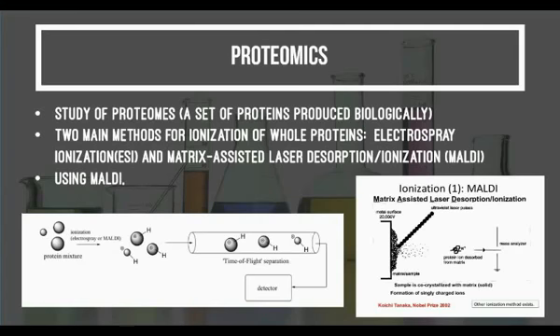Firstly, let's take a look at MALDI. This method can be observed in the diagram here. MALDI methodology undergoes 3 steps. First, the sample is mixed with a suitable matrix material and applied to the metal plate. Second, a pulsed laser is directed onto the sample, triggering vaporization and desorption of the matrix material and the sample. Finally, the analyte molecules are ionized by being protonated or deprotonated in the hot plume of vapor gases and can then be analyzed by passing through the mass spectrometer.